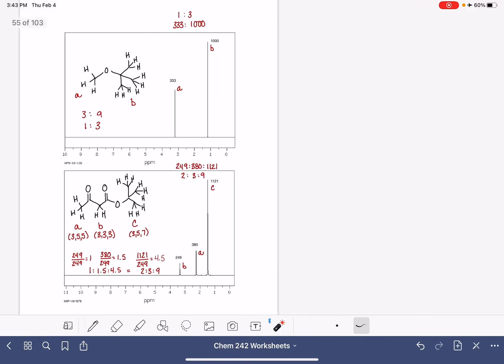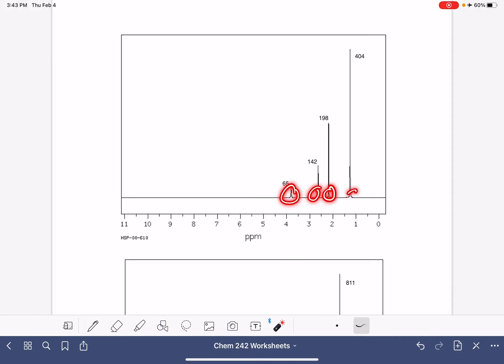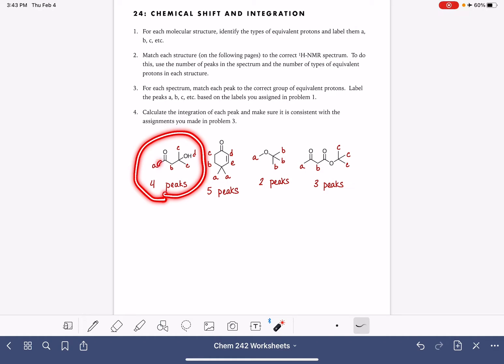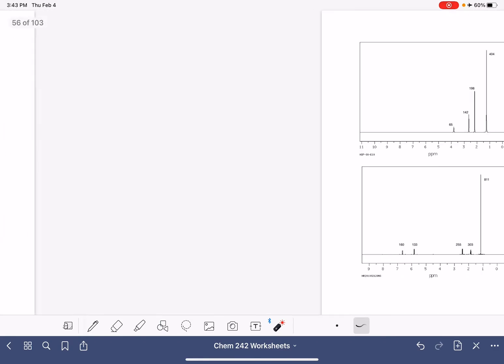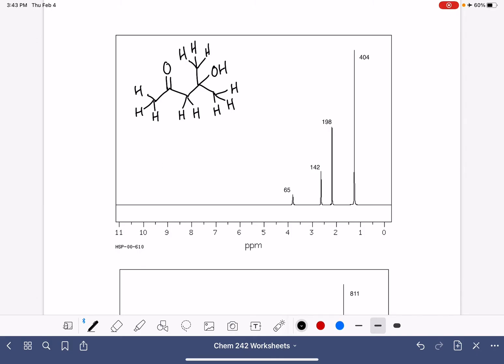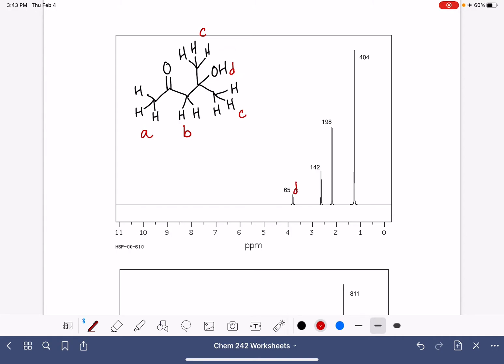Our next NMR spectrum has four peaks, so we want the molecule with four types of protons. The four types are: proton A, proton B, proton C, and the OH labeled D. These are the A's, these are the B's, these are the C's, and this is the D. These are also C.